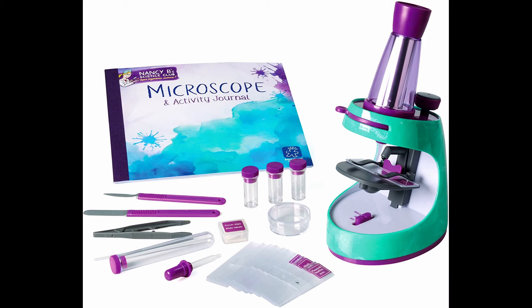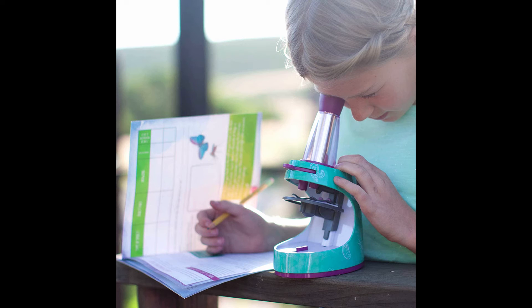Educational Insights Nancy B's Science Club Microscope and 22-page Activity Journal, 400x Magnification, Science for Kids. About this item: 400x Microscope for Kids — zoom in on the fun with this 2-in-1 Light and Dissecting Microscope and 22-page Keepsake Activity Journal. Requires 3 AAA batteries, not included.